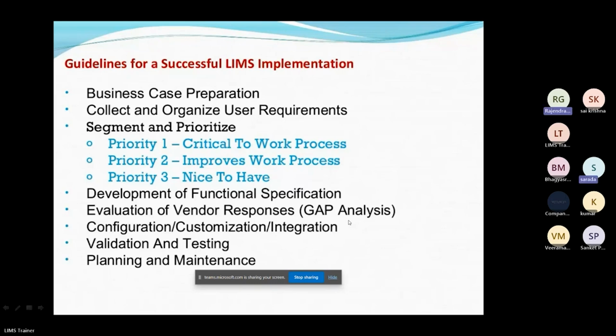Sir, you mentioned guideline, but which guideline are we following? The content says guideline for successful LIMS, but which guideline are we following?